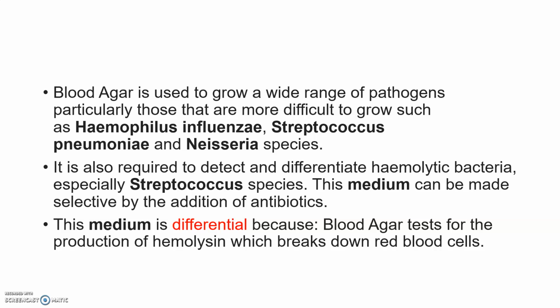In normal nutrient agar these pathogens are difficult to grow, but in blood agar they may grow because those organisms are fastidious and have special nutrient requirements, which are all available in the blood agar.